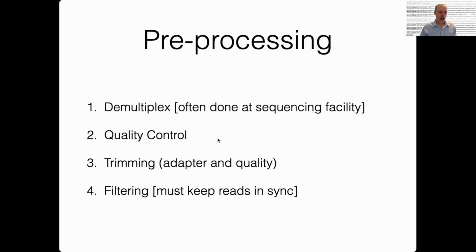The next step is quality control. Basically, it's looking at the data and trying to get a feel for whether it's total garbage or whether it's okay or somewhere in between. We usually use that information in the next two steps. We're going to do quality control hands-on in a little bit, because I feel it's more helpful to actually be working with it.